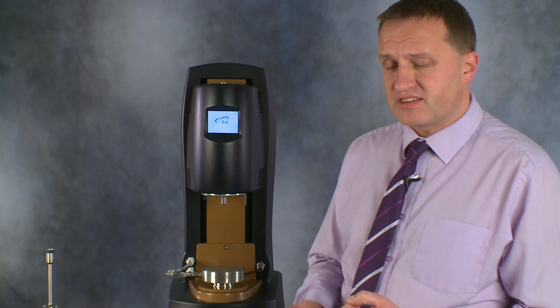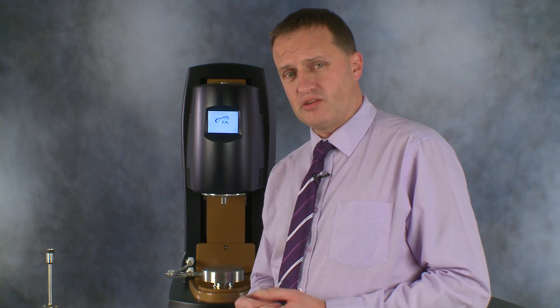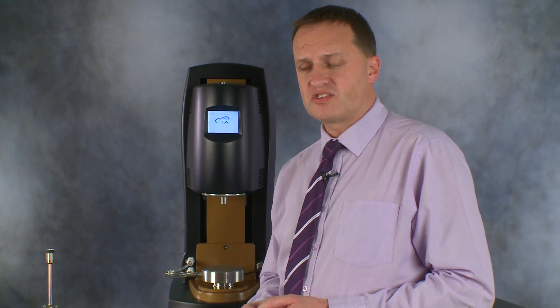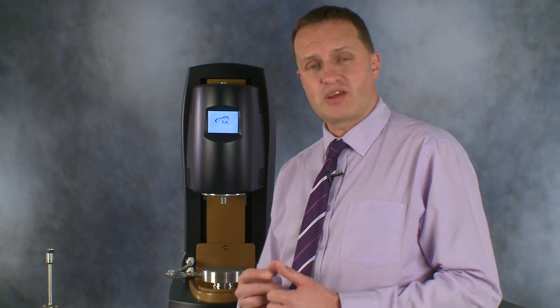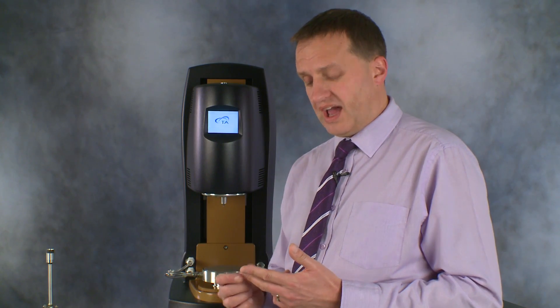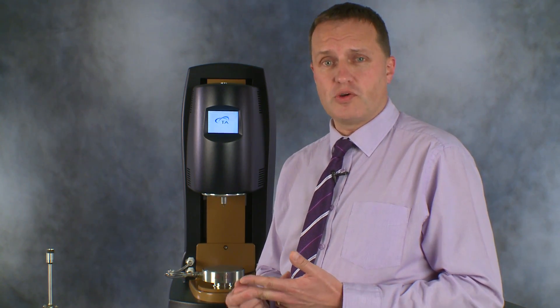Choosing the material tends to be a choice of stainless steel, titanium, or aluminium. Stainless steel can take anything that's thrown at it in terms of being chemically inert, good for high range of temperatures, and basically an all-around good workhorse.